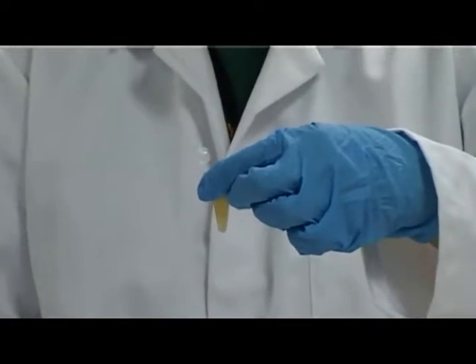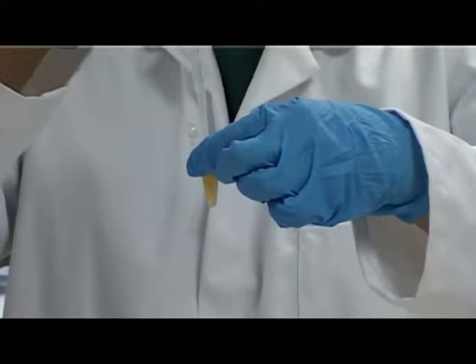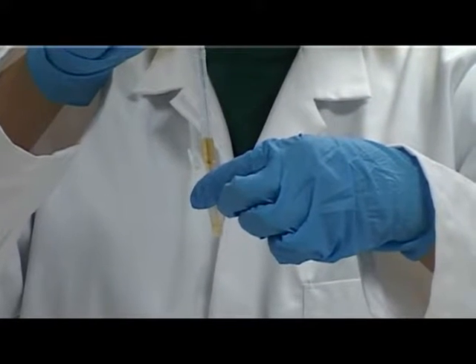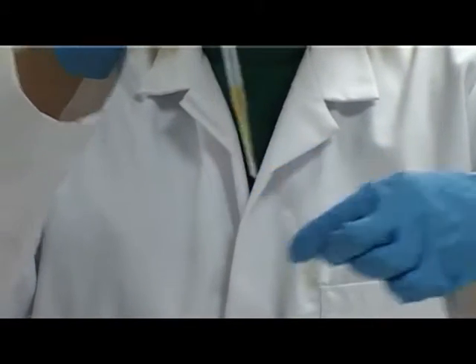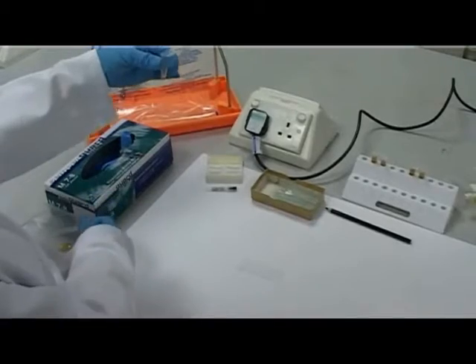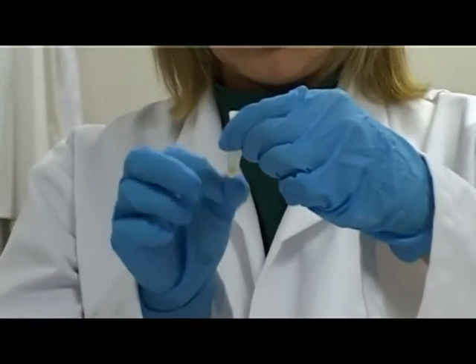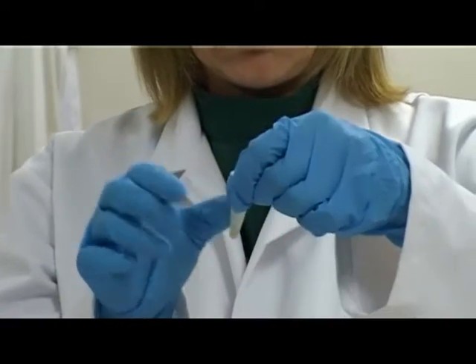Remove most of the supernatant fluid and dispose of it correctly. Ensure the sediment is not disturbed while doing this. Resuspend the sediment in the remaining supernatant fluid by either flicking the tube or gently shaking it.